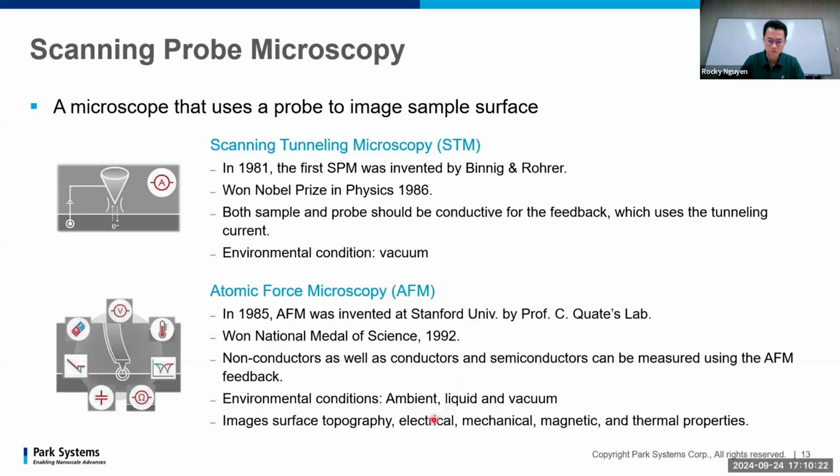And also with the AFM, we can measure surface topography. We can also measure the electrical, mechanical, magnetic, or various properties such as the thermal properties of the materials.